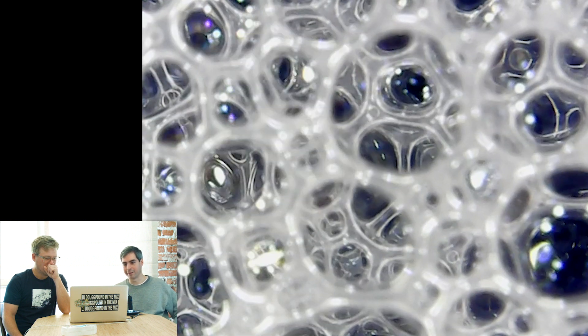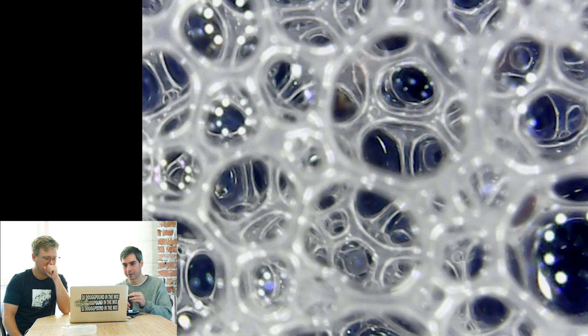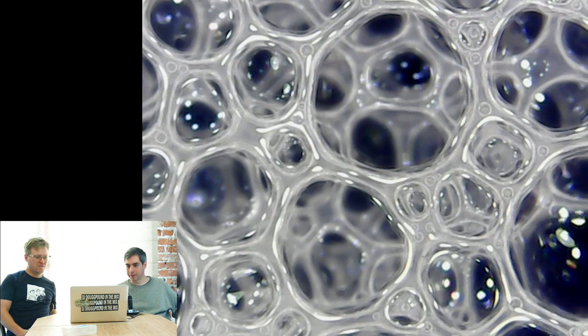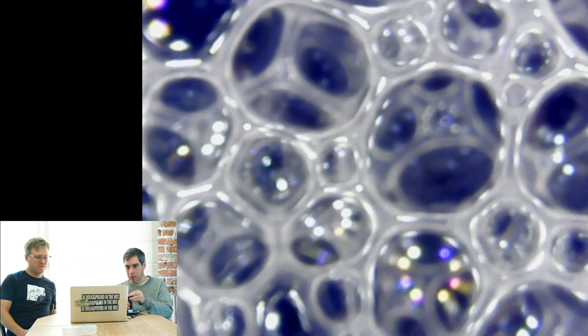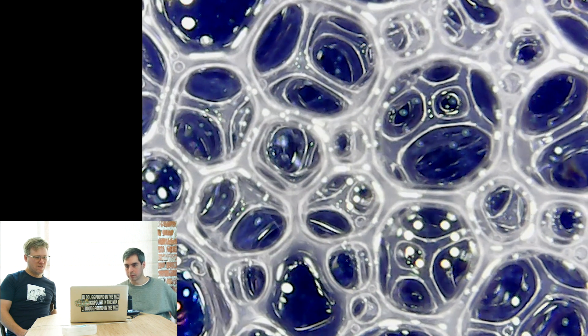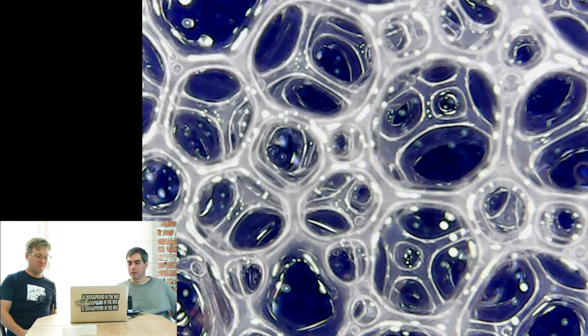All right, well anyway, good topic. Wow, look at that. I love it. You go on and on, of course. I love when it moves. It was perfectly in focus, now it's not. Well, I wanted to get it moving again. There you go. Well, I'm going to go wash my hands now. The World of Bubbles on Microscope Show. Only on Microscope Show.